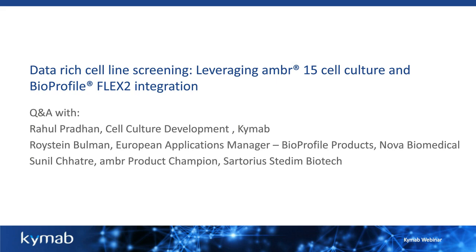You can chat with your Sartorius and Nova reps, and they can make suggestions and help you out with the locations of various kits as well. For example, the FLEX2 always has to be on the left-hand side of the ambr. So if that's the consideration, you need to make sure that you design your lab appropriately.